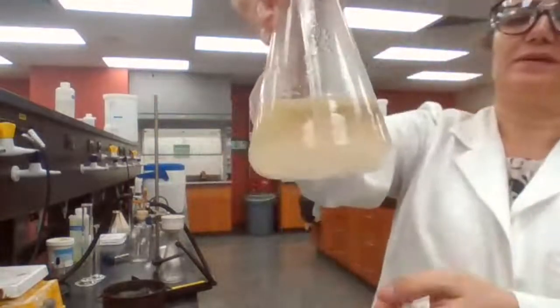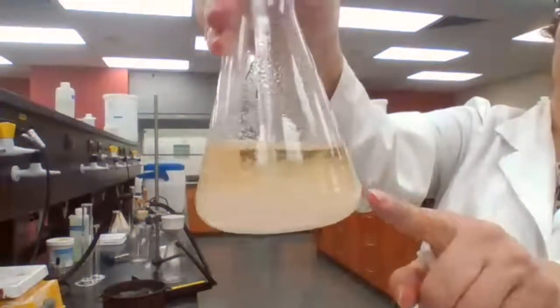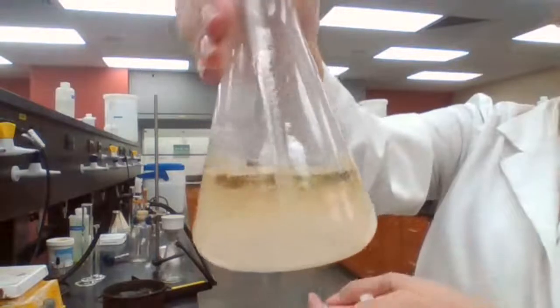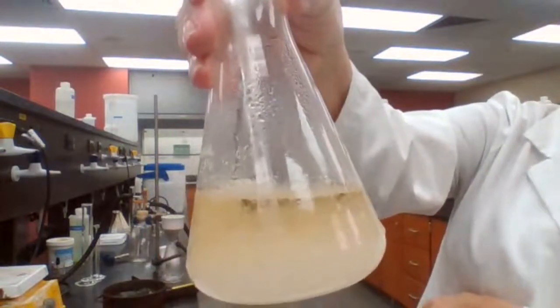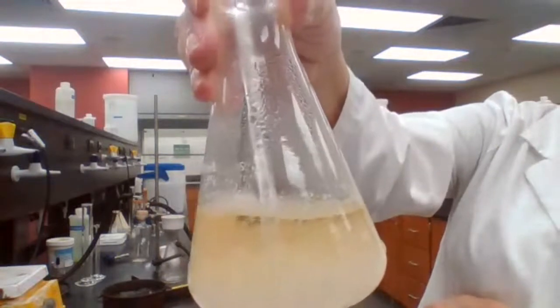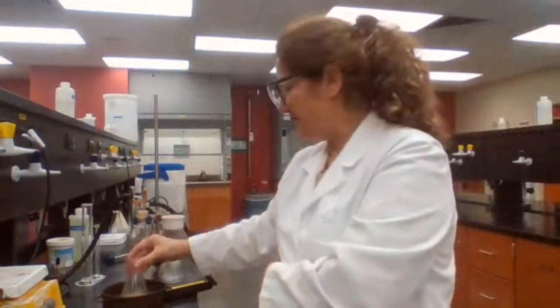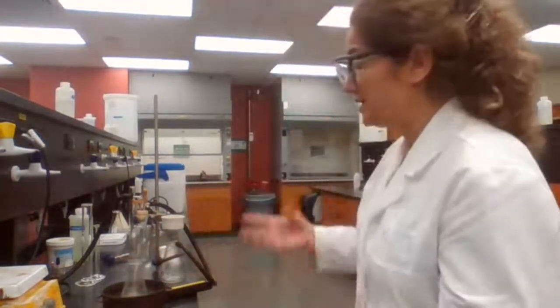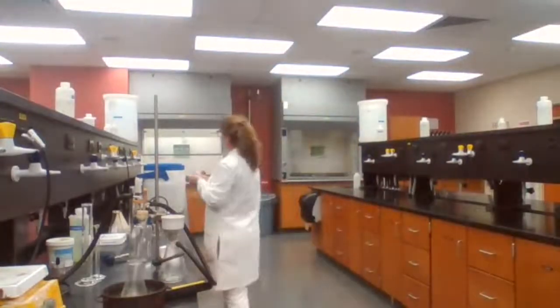So I have my 555. It's 5 minutes timing for the ice bath. That gives enough time for the solution, if it's immersed in the ice. Maybe this one looks better. Students in the lab really like this texture here. It's very clear that crystals are forming and they're floating. Nice size of crystals. So when you put it 5 minutes in the ice, it's going to complete the crystallization. The temperature would be low enough to form the crystals.